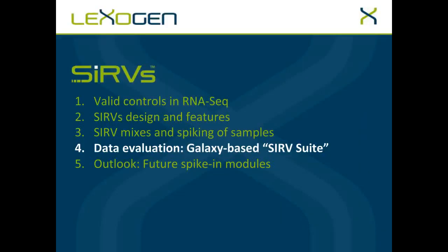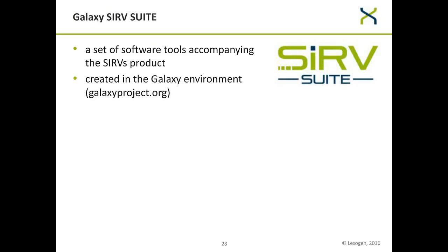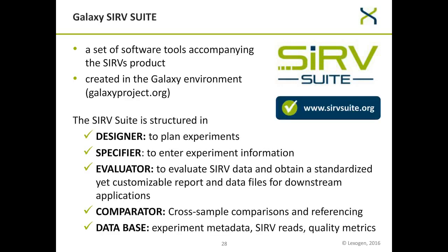Now that we have created our mixes, we can perform a SIRV experiment. And this is actually now the occasion where I can introduce the SIRV-Suite to you. The SIRV-Suite itself is a set of software tools that is freely available. Actually, we've got a cloud-based instance running this SIRV-Suite, and it is created in the Galaxy environment. So many of you might be accustomed to that environment. It is accessible at sirvsuite.org, and actually it is structured into major modules.